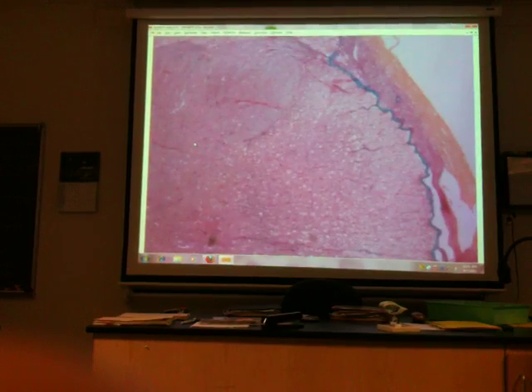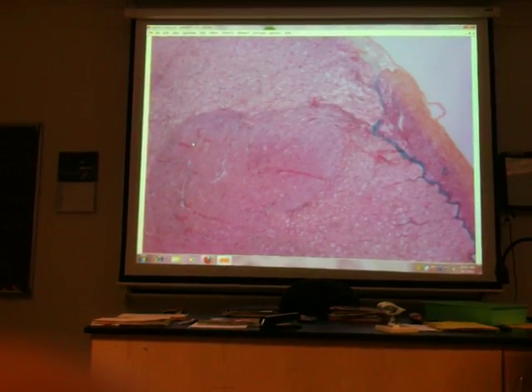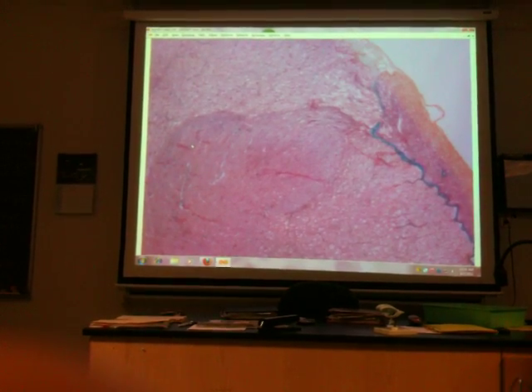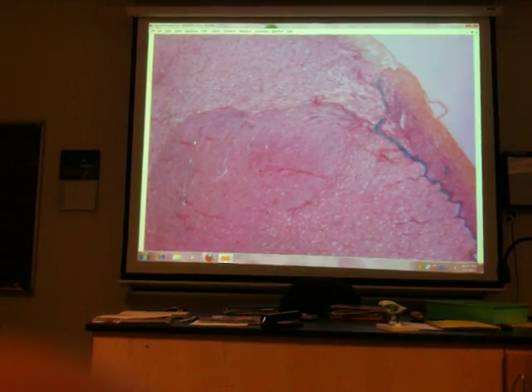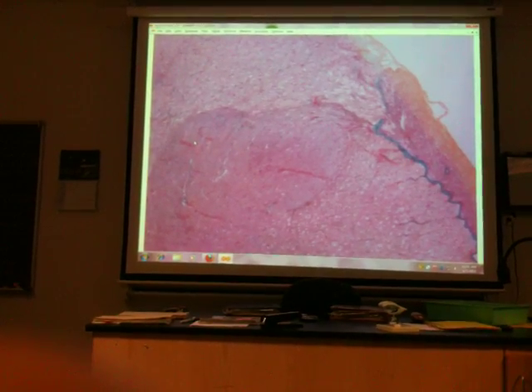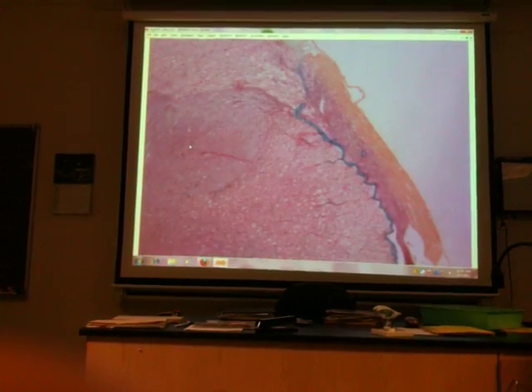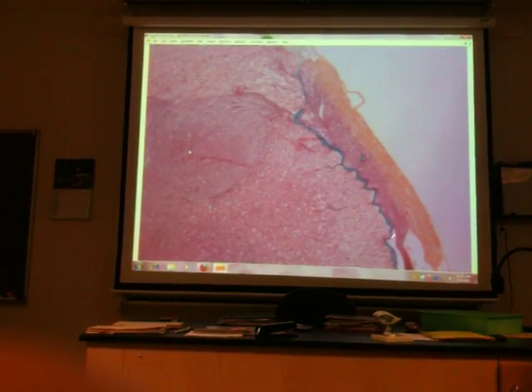Okay? And the last thing is what attaches to the cord. Now I'm not having you name the meninges on the cross section because they get all moved around as an artifact of the slide preparation. So we're not naming meninges as I ask this question, but in blue this is one of them.